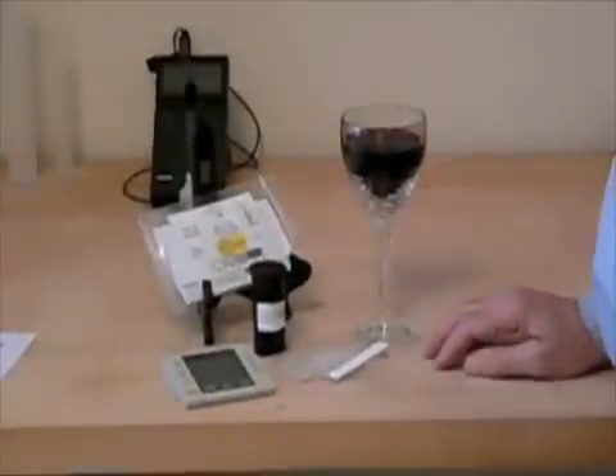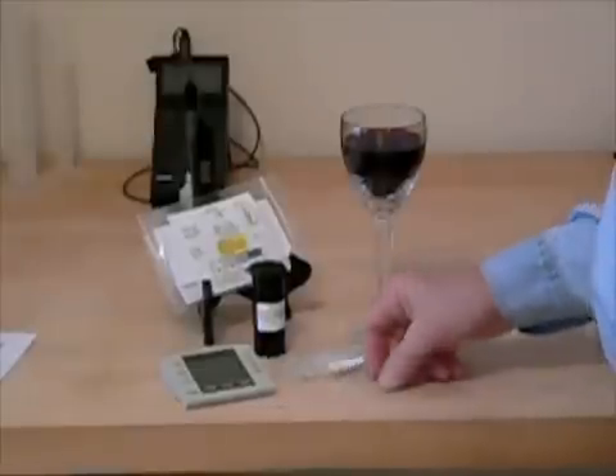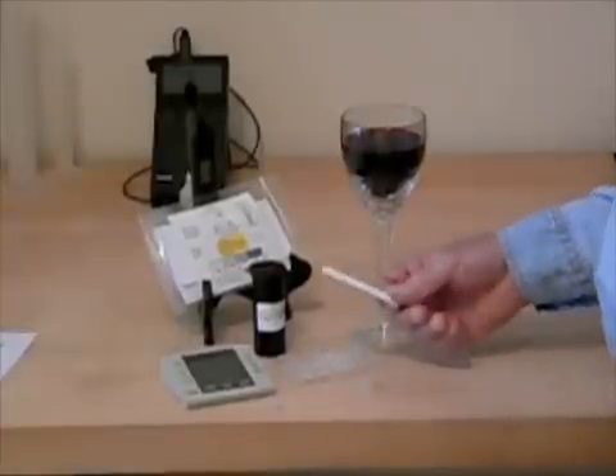This is a malic acid test kit. These tests determine where your wine is in the malolactic fermentation process. You will need a sampler and a test strip to run this test.